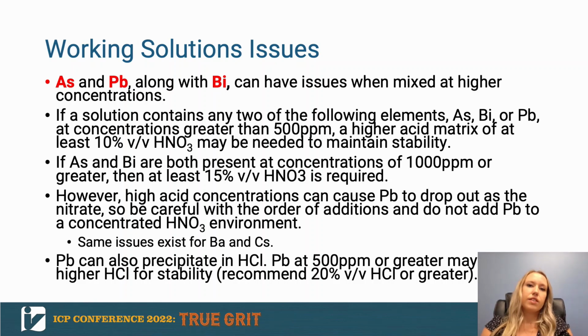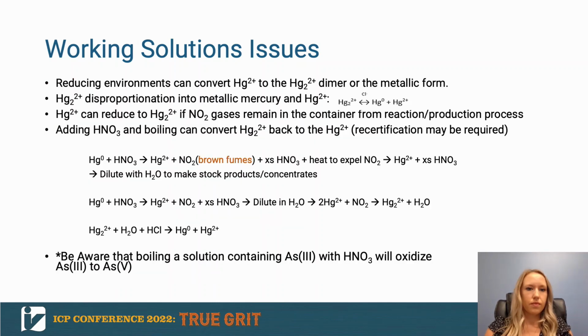So if you're adding those to your analysis, you want to keep that in mind as well. And then also lead can have issues in hydrochloric acid. So again, this is just a solubility issue. If you have a high concentration of lead, you may need to increase your hydrochloric acid concentration as well to make sure that the lead is going to be stable.